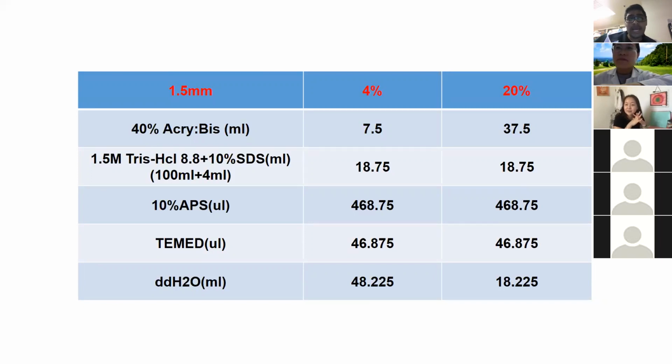And during the COVID time, in February, I ordered so many things, but they didn't arrive regularly. So we can make it in an emergency also, because we can store it at 4 degrees. This is the good thing, just like a commercial one. Yes, this is very interesting.